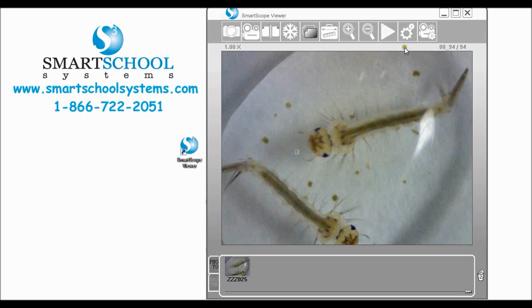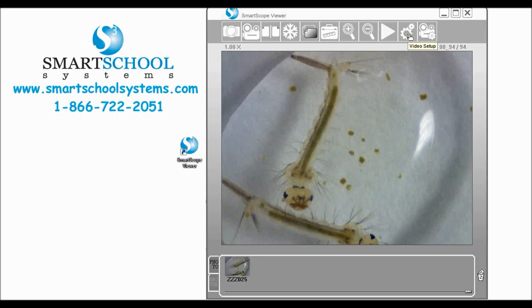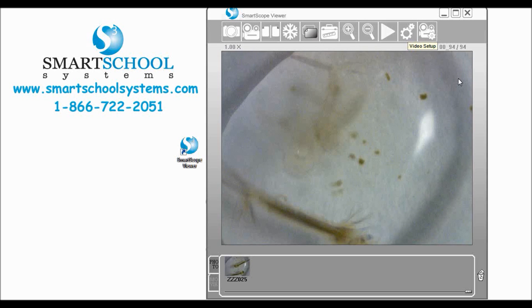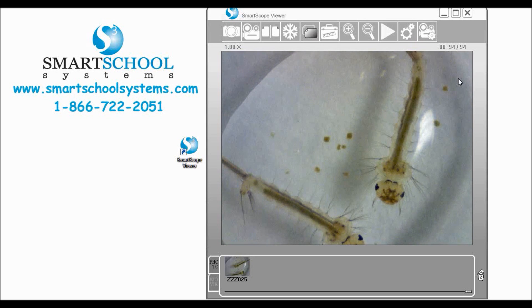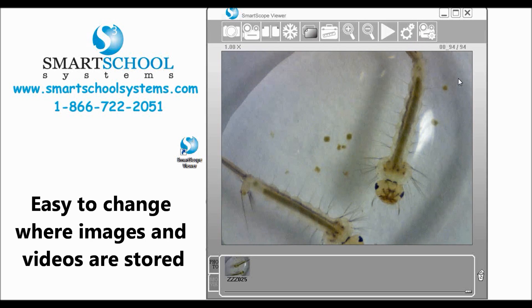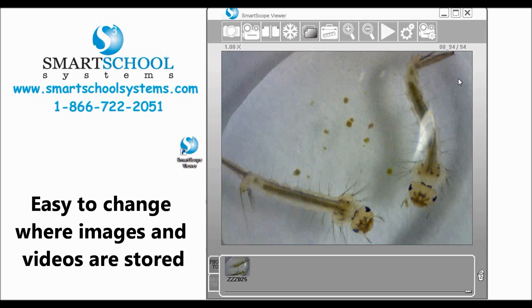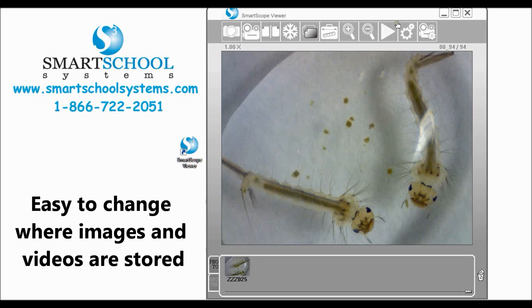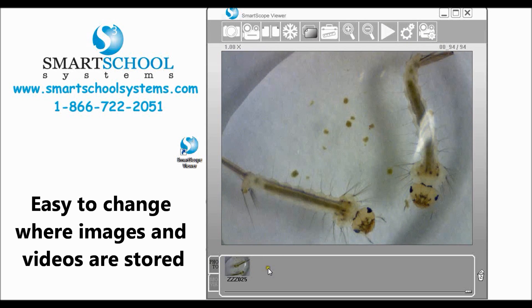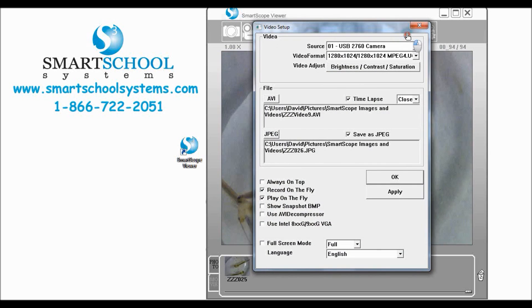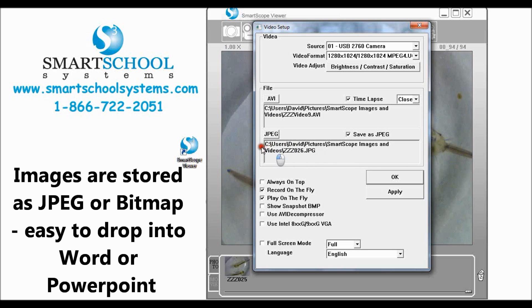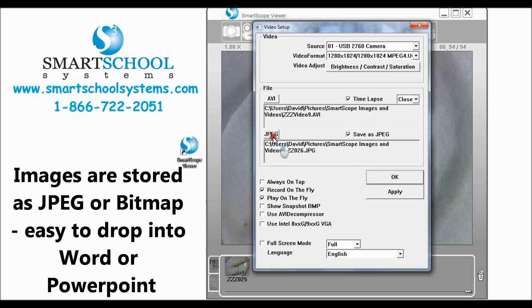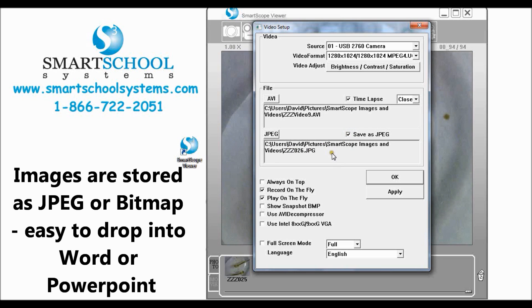So the last thing I want to do with this video is one of the questions we get a lot is: I've taken a ton of pictures with my SmartScope, where do I find them? I know I can view them here but where do I get to them? You can click again on your video setup icon and come down here and this tells you exactly where your images are stored. You can save your images as JPEGs or bitmaps so either one of those can be dropped into PowerPoint or Word.